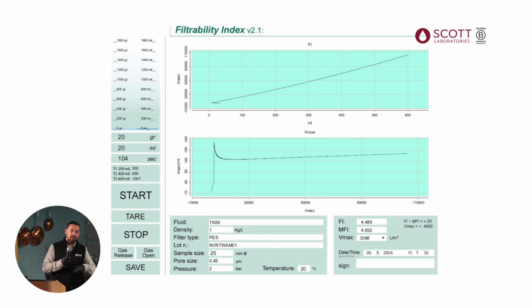A lot of you guys, depending on the style, what technology you're using, you have to stand in front of the unit, you have to time it, you have to record those times and seconds, and then you have to calculate it. A lot of that takes time, right?